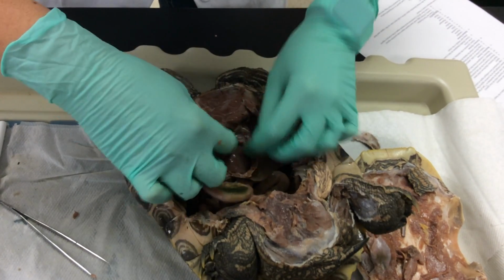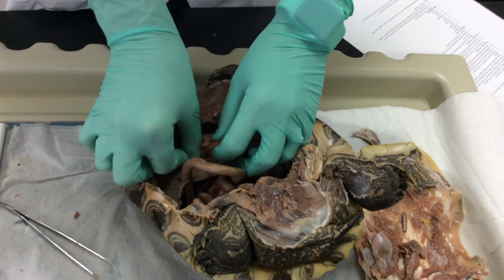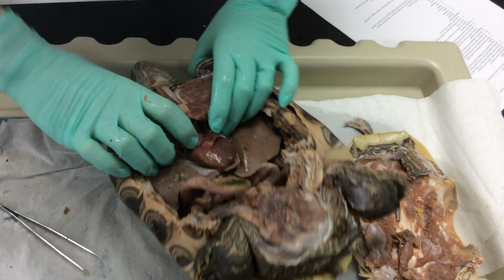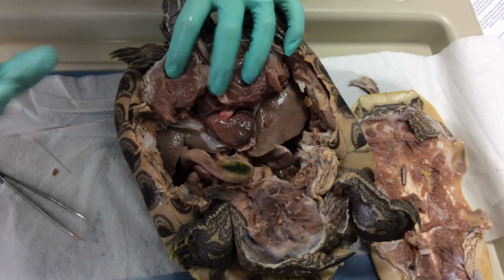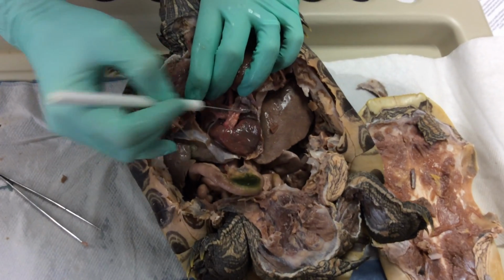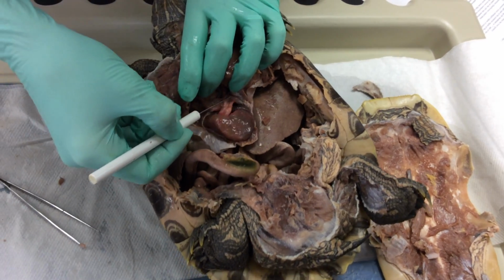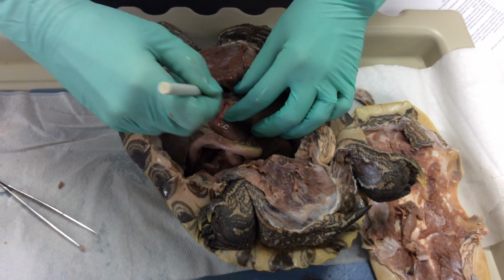Alright, so in this particular case, these are organisms that are reptiles, which have 3-chambered hearts as opposed to the 4-chambered heart that we see in mammals. And if we're looking at the 3-chambered heart right here, we've got the center ventricle, the left auricle, and the right auricle or atrium. And then we have all these tubes that are coming off of them, and these large blood vessels are going to carry blood away from the heart.